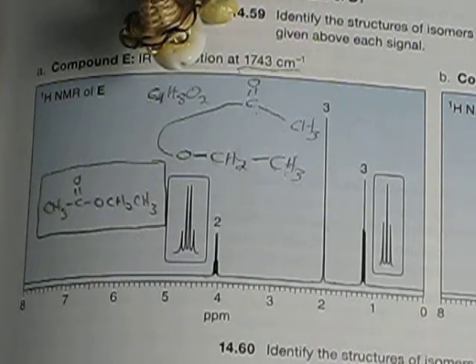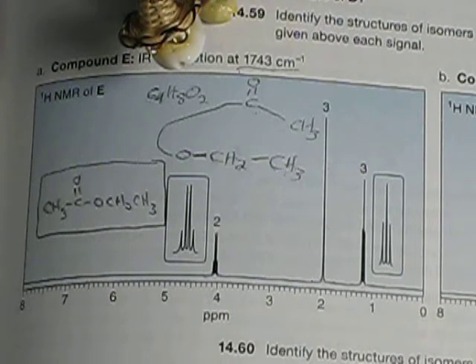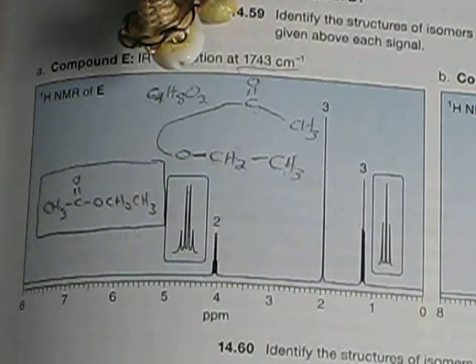And so note the power of proton NMR. This is a situation where I could have been walking by in the lab, saw some white powdery substance on the balance. That could have been anything. It's a white powder. Who knows what it is? Running the IR, oh, I know it has a carbonyl. Stick it in the NMR, run the proton NMR.